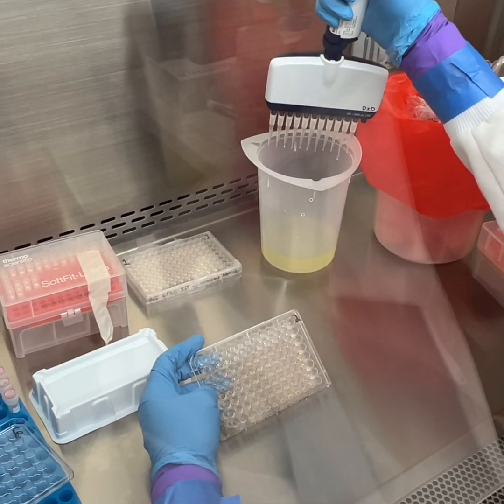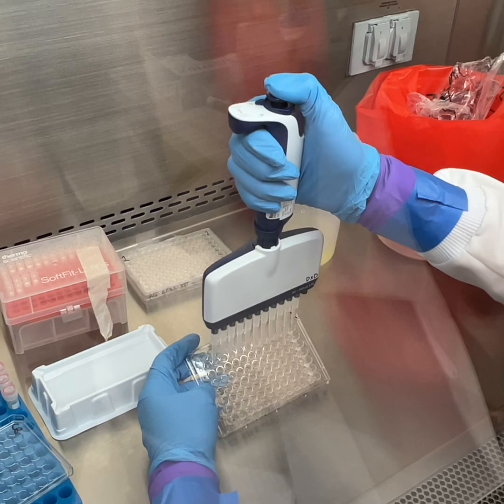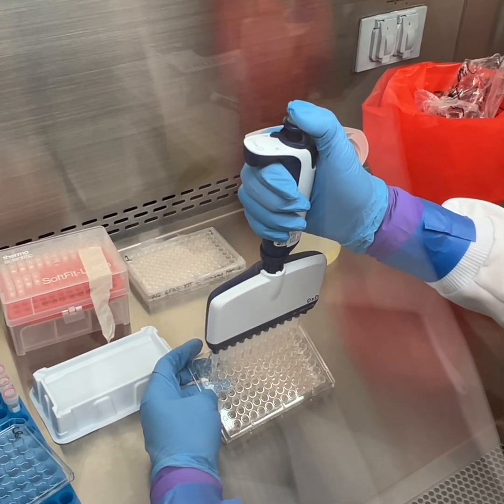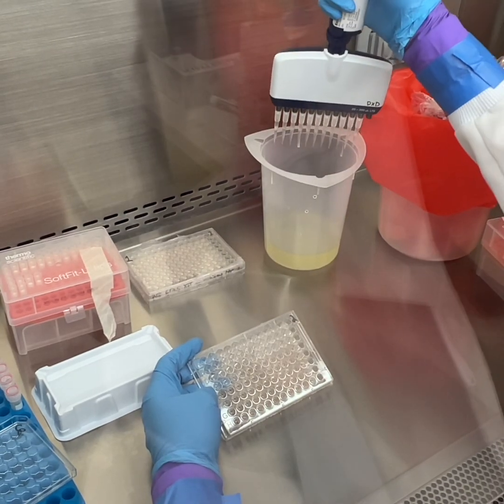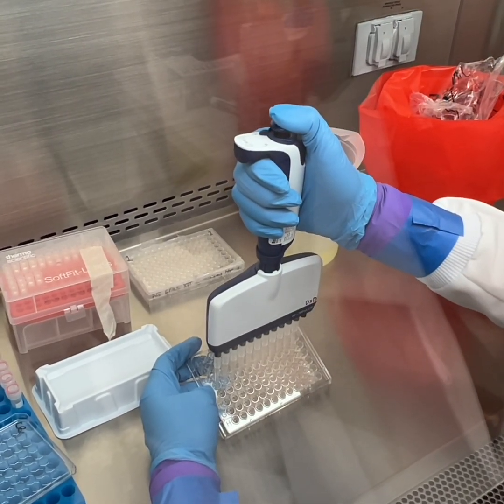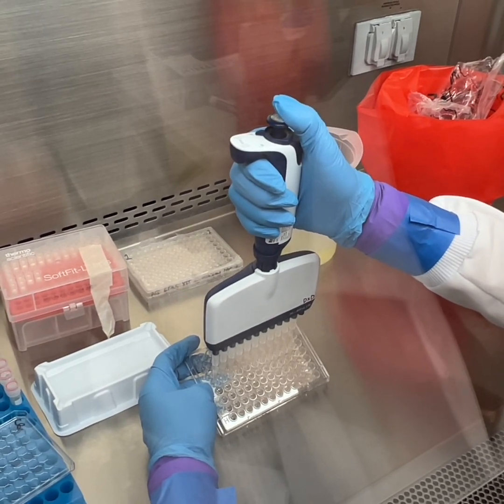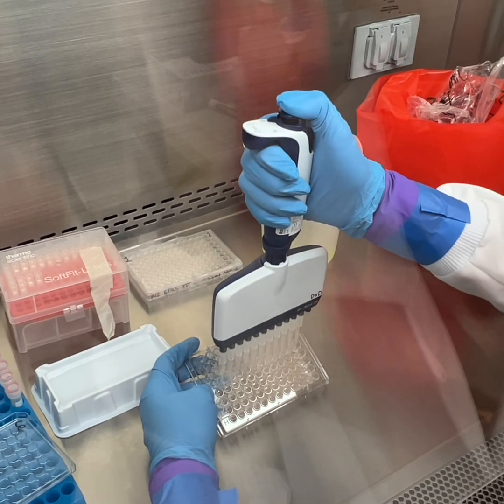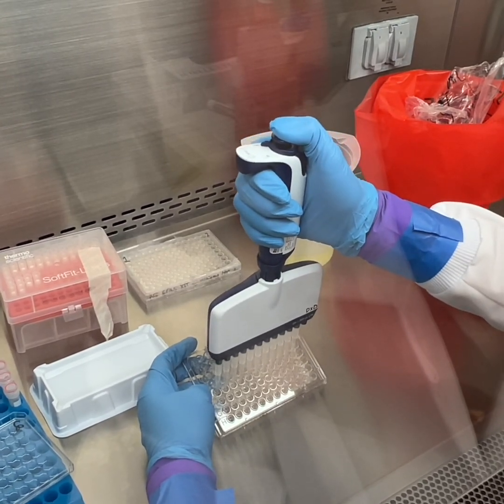Into the bleach. There's still a little bit left, but that's okay because we're going to wash it. That's the point of the washes. Into the bleach, into the bleach. Especially if you're testing something like ethanol, there's going to be more evaporation in the wells that have a higher concentration of ethanol.